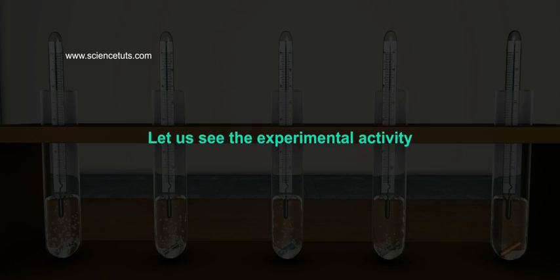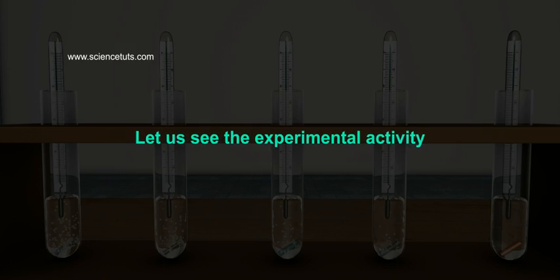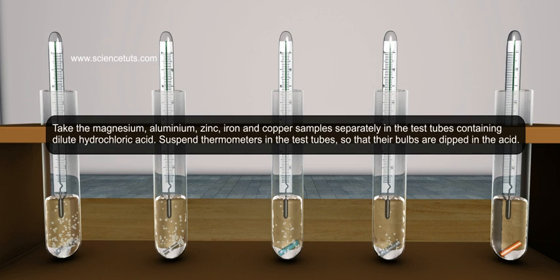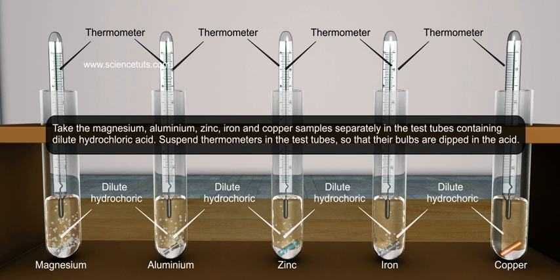Let us see the experimental activity. Take the magnesium, aluminum, zinc, iron, and copper samples separately in test tubes containing dilute hydrochloric acid.